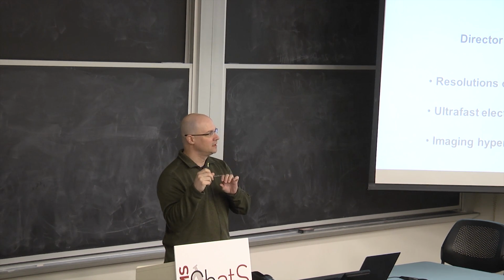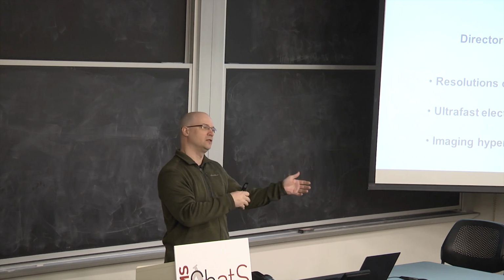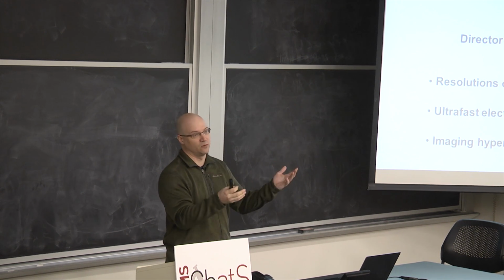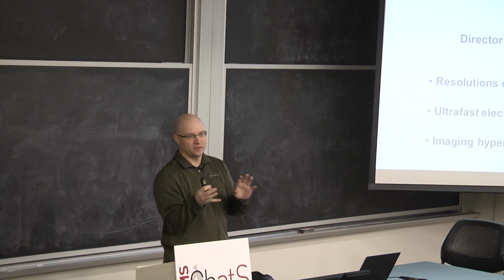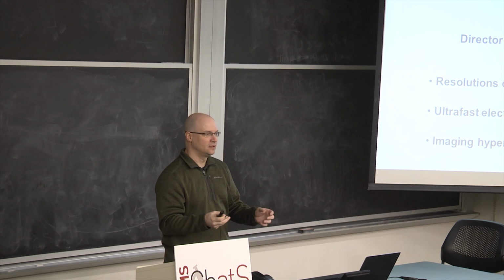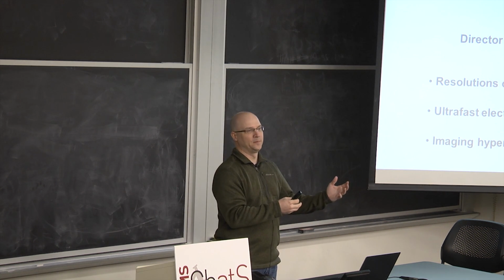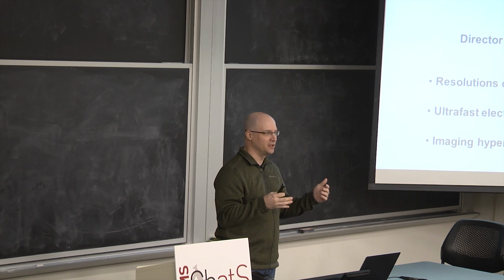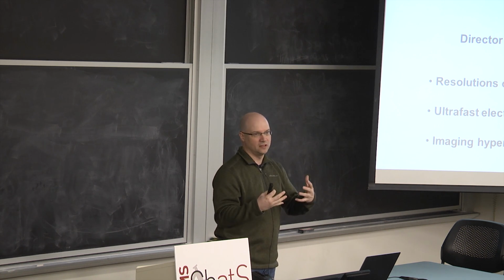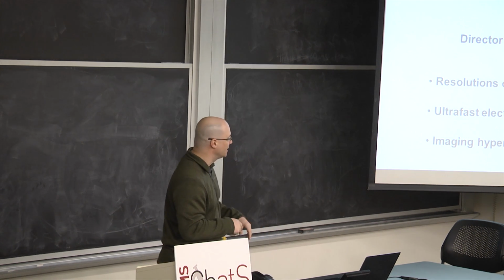real time? And so I think to start, we have to understand, A, how do we normally look at materials at the levels that we want, meaning atoms? And then what can we do in terms of time resolution currently? And then what do we actually need to do much better, right? So if you think about it, atoms move fast, right? They're moving really, really quick. So how do we actually develop tools to watch that process? That's going to be the idea.